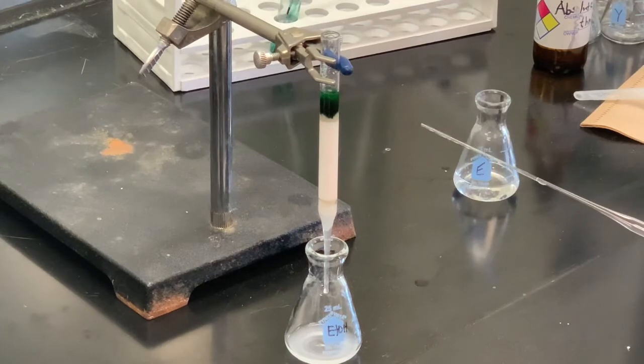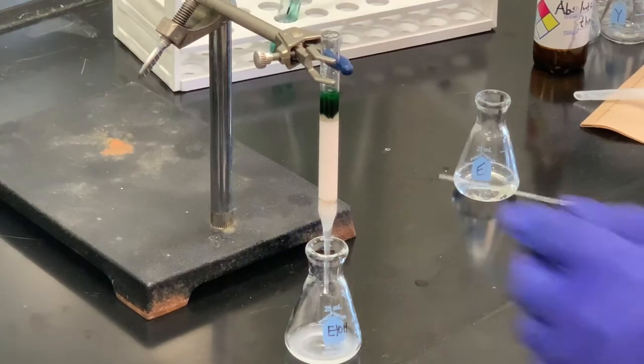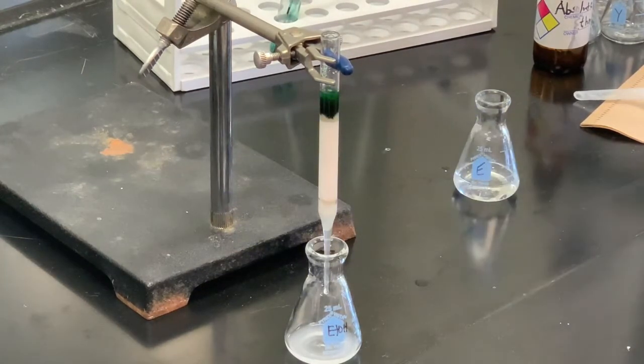When that layer gets right above the sand again, I'm going to add more of the solvent. I don't want to add a lot of solvent right now because I don't want to dilute the sample. I want that to be as concentrated as possible onto the sand.